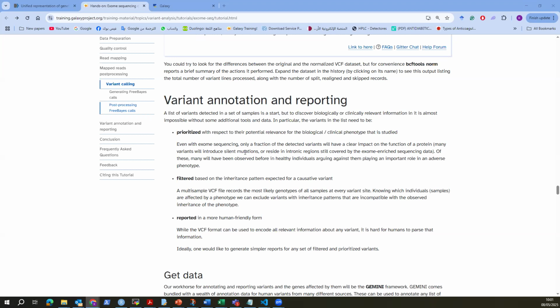I would assume that some researchers, or inexperienced researchers, would assume that if we detect a variant or deletion on the coding genome, which is the exome, that it is pathogenic. However, not all of these variants are pathogenic. Some of them are benign. Even if they change the protein structure, there won't be any change in the function of that protein or the phenotype. So they would be responsible for the variation of the phenotypes among species or within the same species.